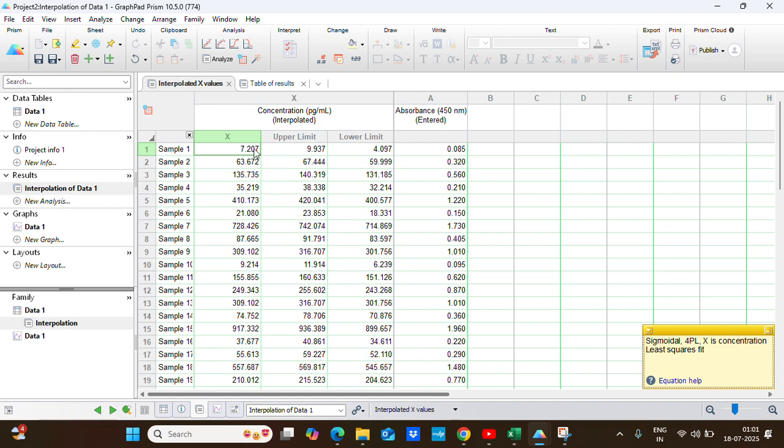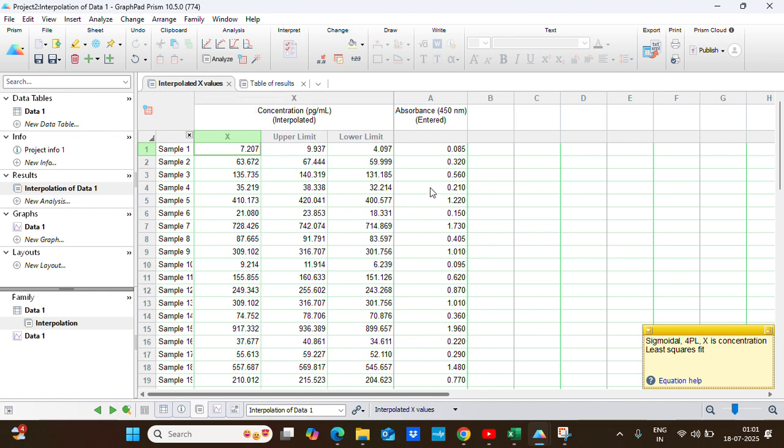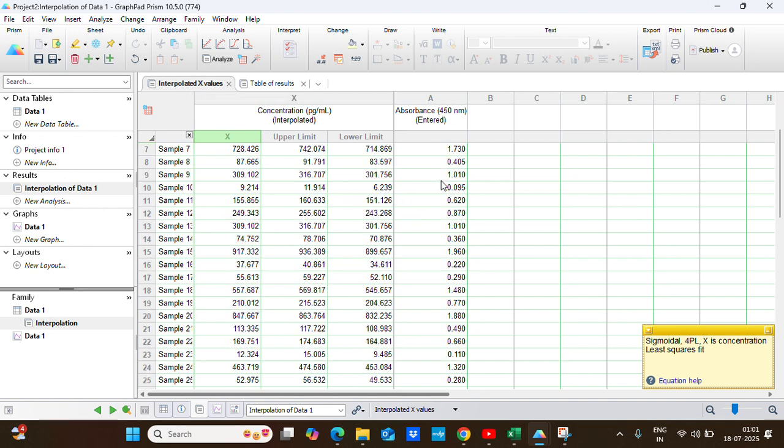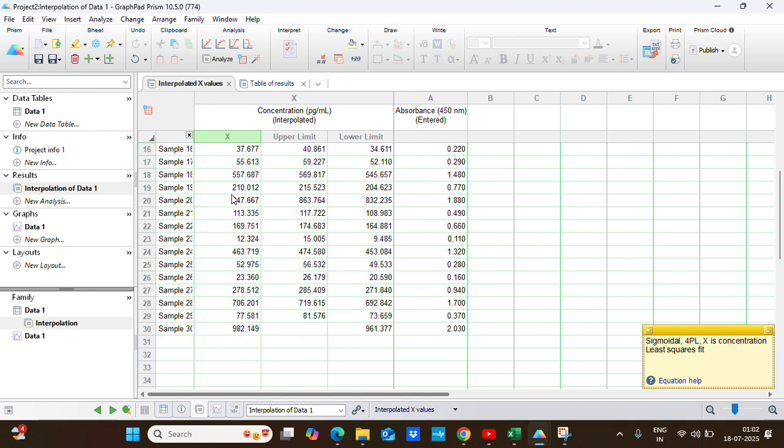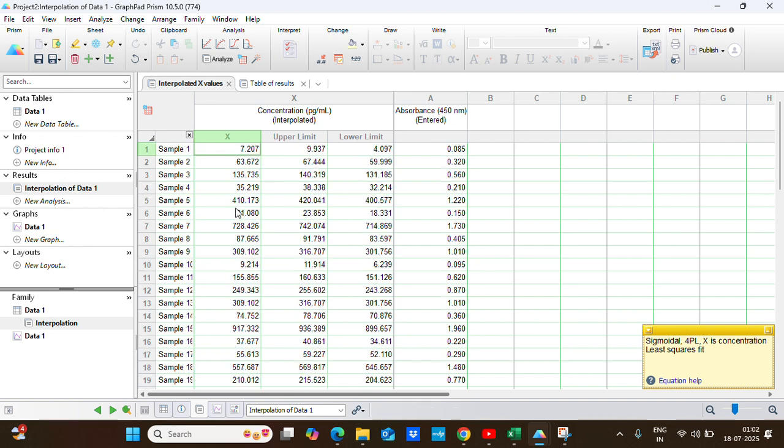Now we will get two sheets. First is the interpolated X value where we can see for each sample value we get the unknown concentration, and this is the 95 percent confidence interval: one is the upper value, one is the lower value. This is all our unknown concentration calculated by GraphPad Prism.